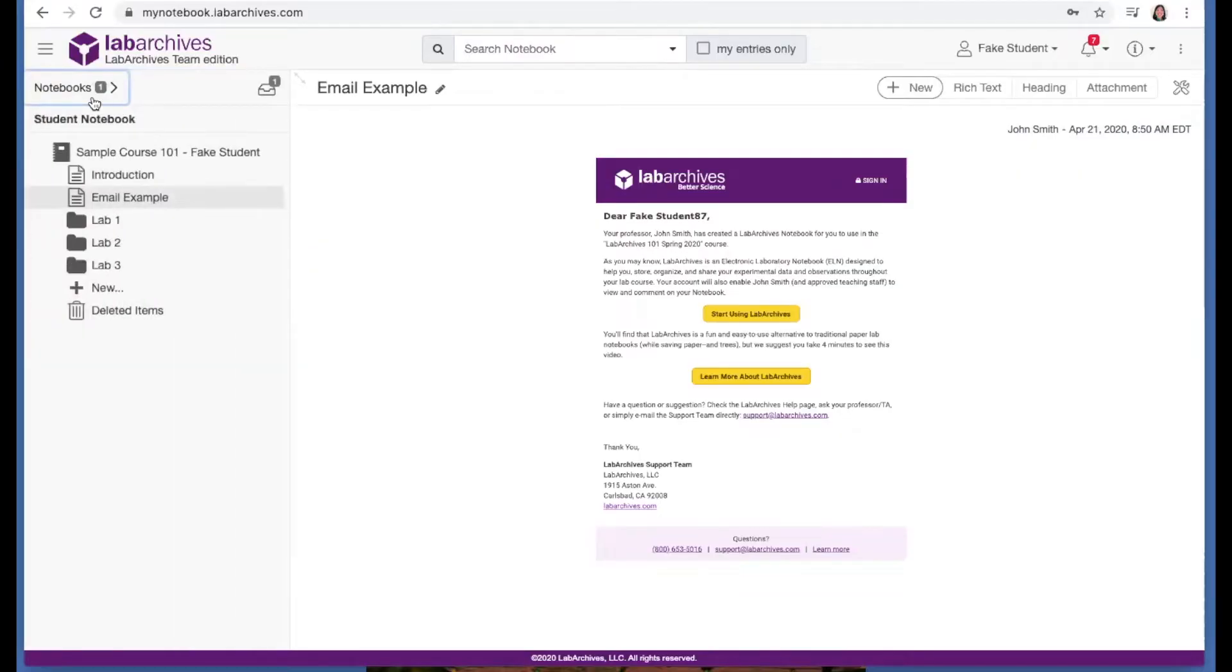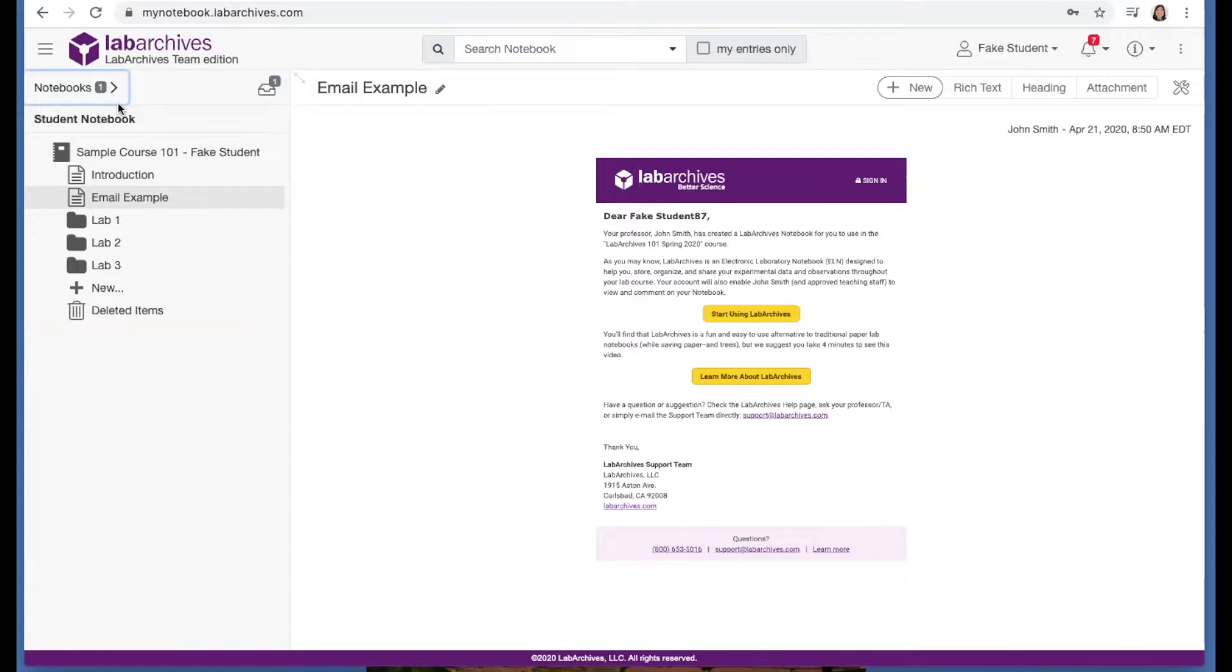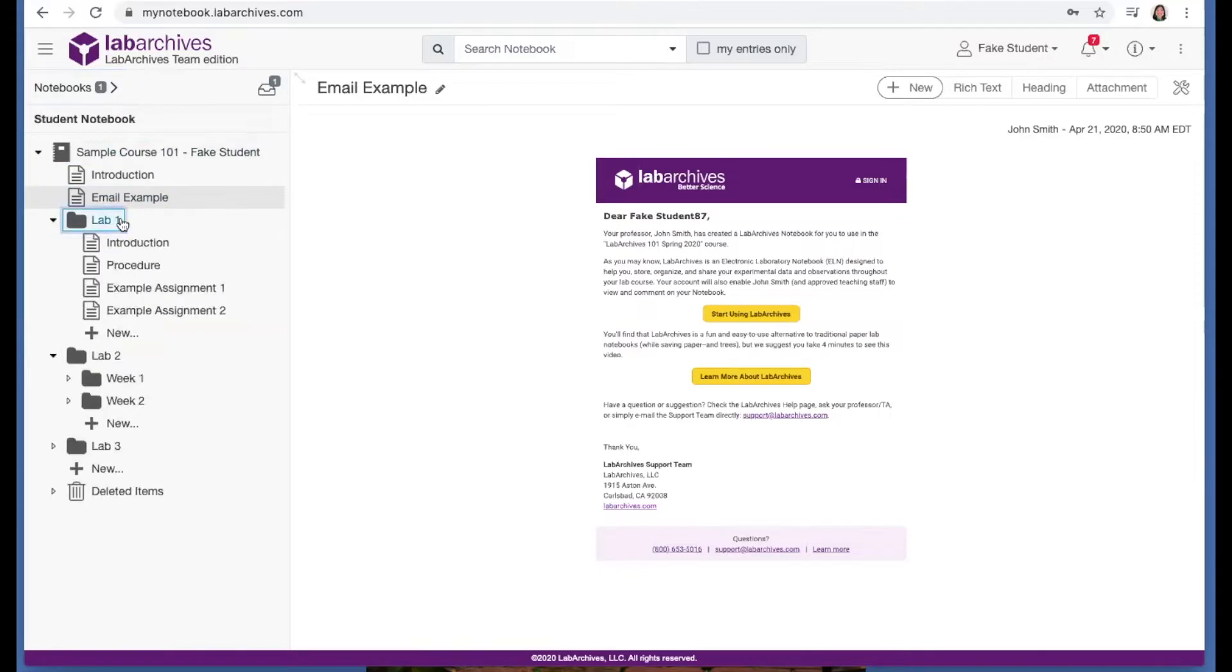Your instructor has designed your notebook. All students start with the exact same notebook. This acts as a template for organizing your work. Your notebook may contain folders and subfolders and pages.